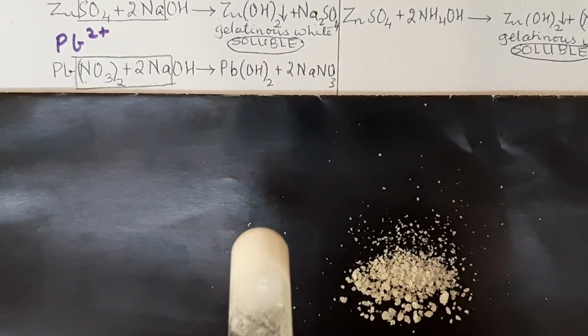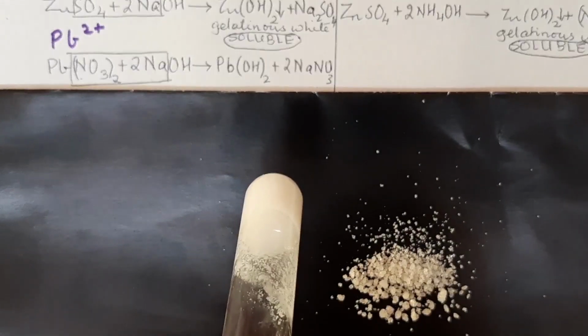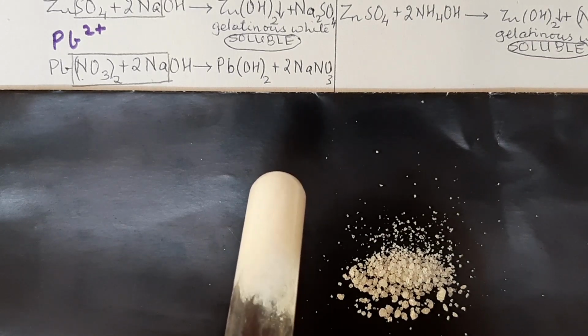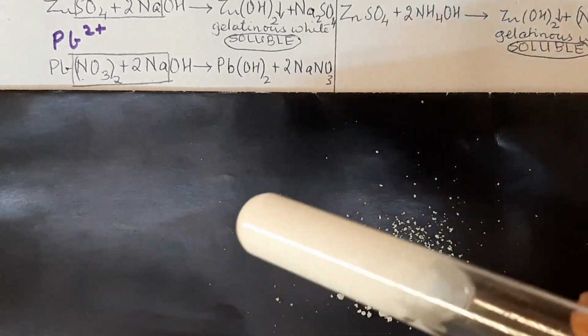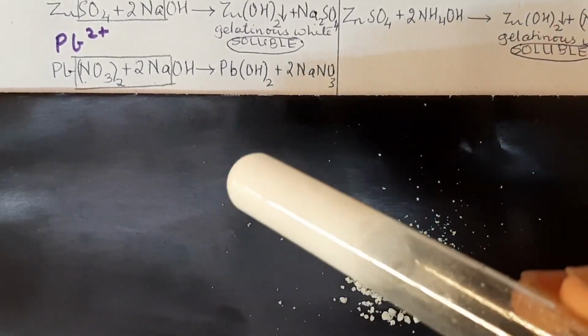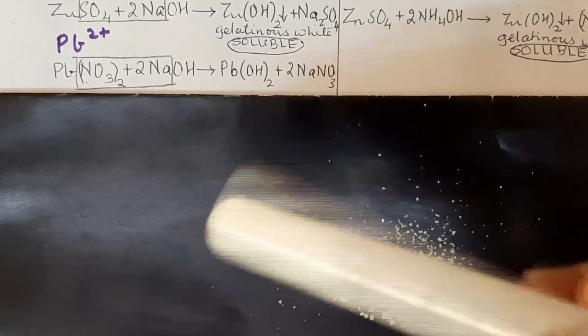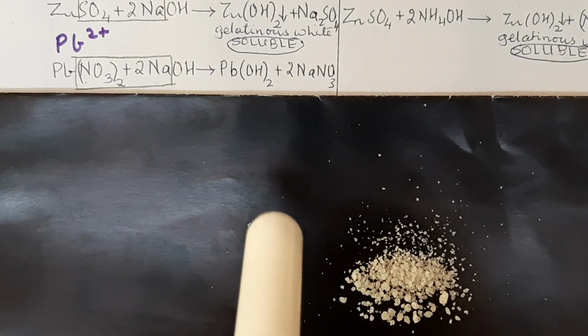Let us add excess of sodium hydroxide. You can see it has become less chalky.